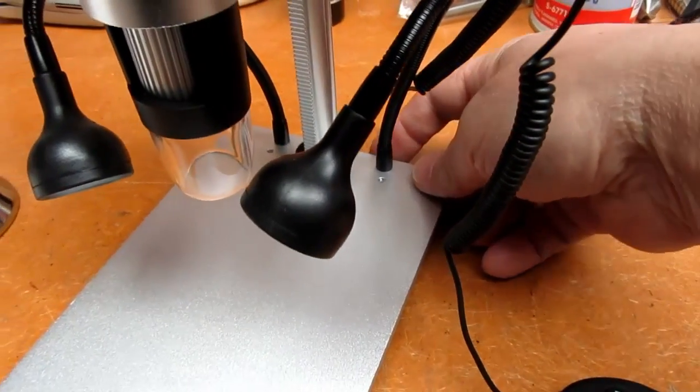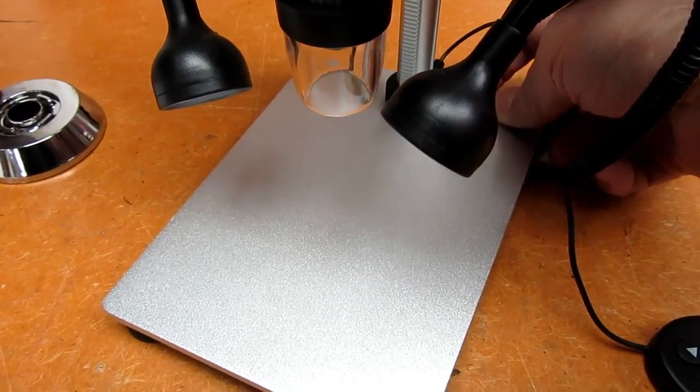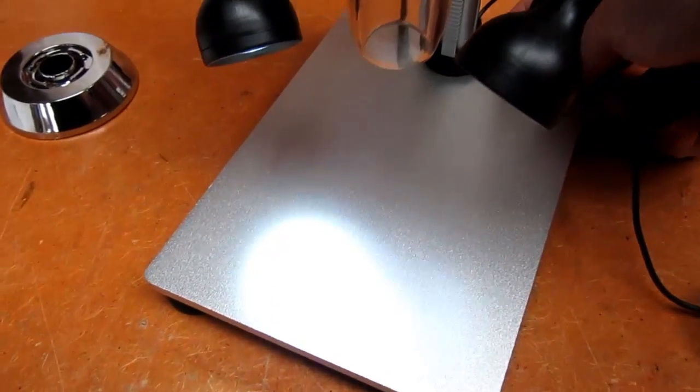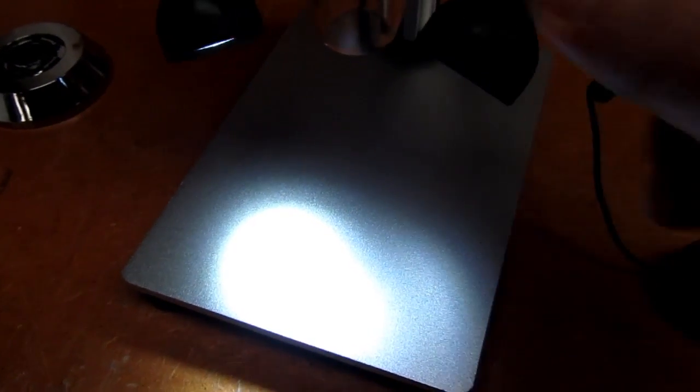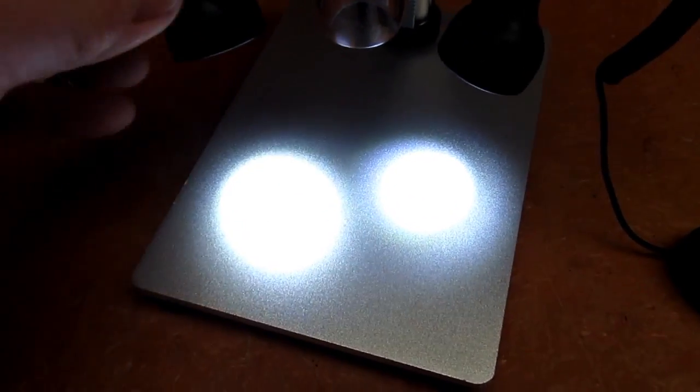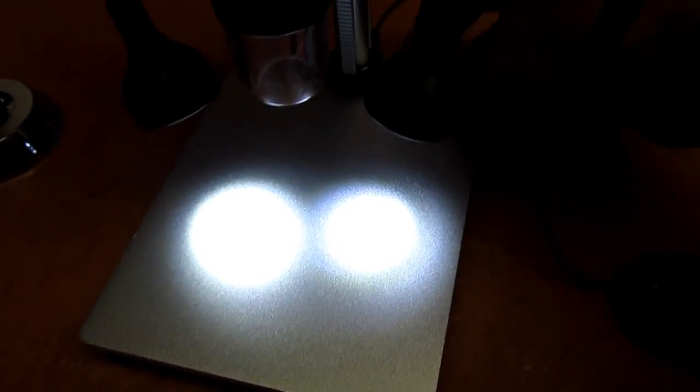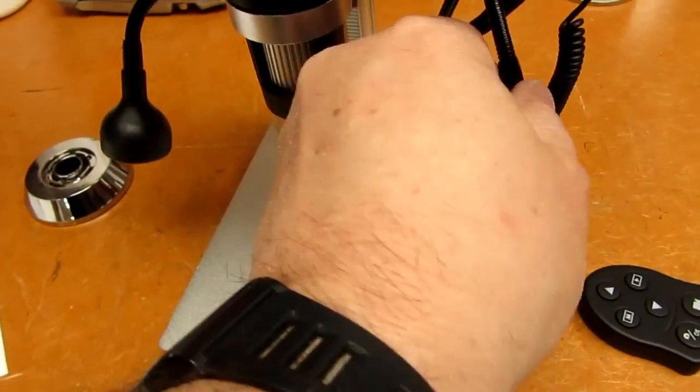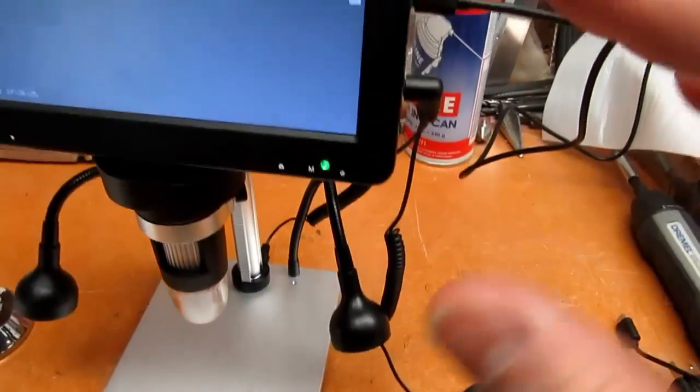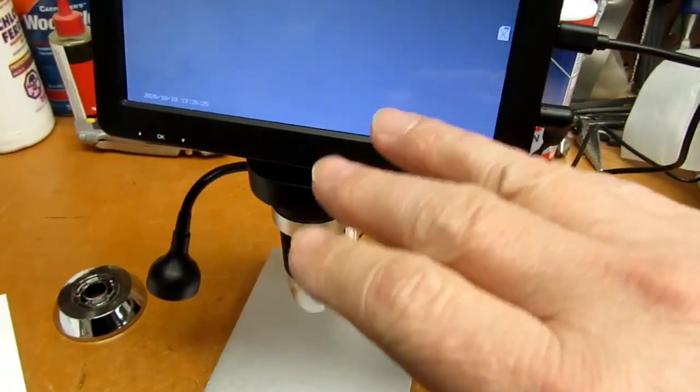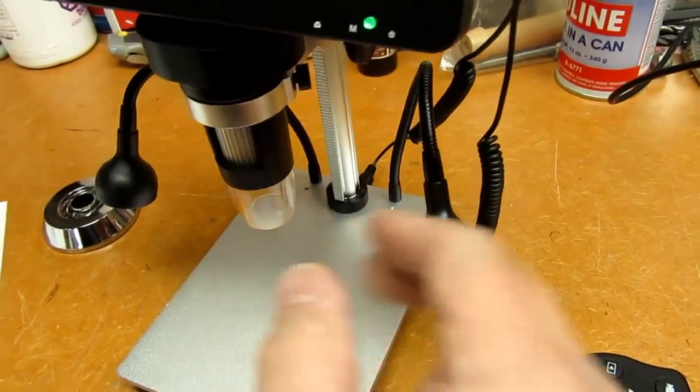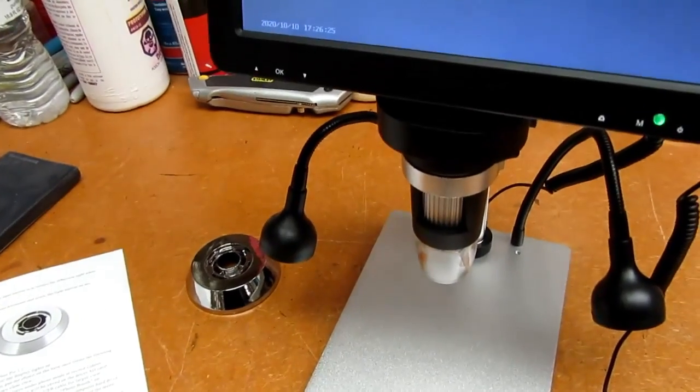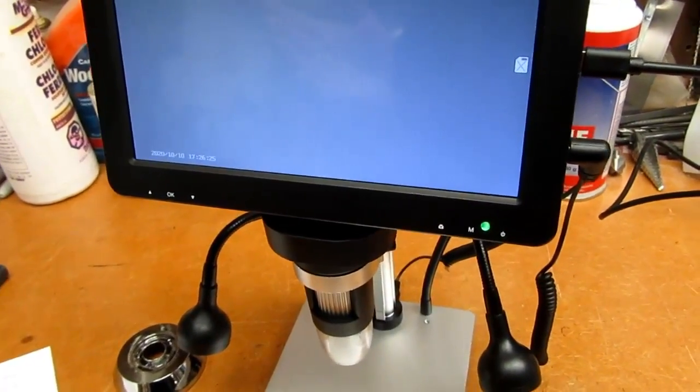Anyway, so getting back to this, I can use this knob here to turn the light completely off or bring it up to quite a high level. So I was starting to say that what you get with the package when you buy this is the microscope with its screen, the stand and its vertical post, the two lamps, the wired remote control, the light barrier, and that's it. To fully use this you need to have a longer USB cable, something that can reach from this to a personal computer.